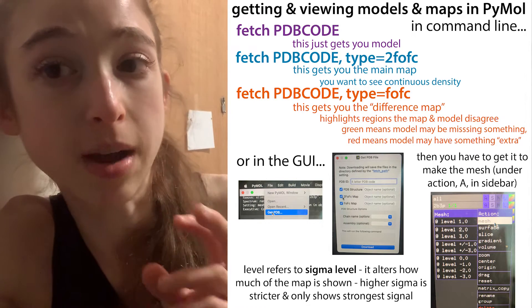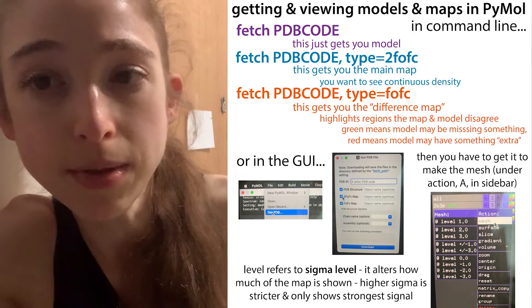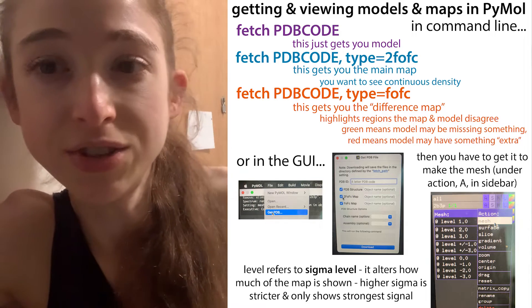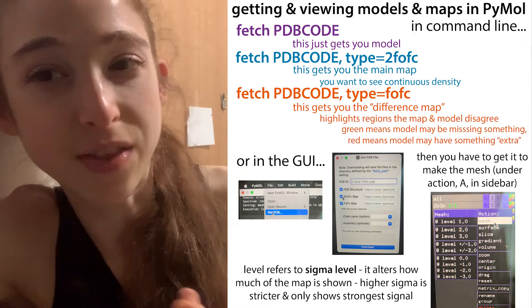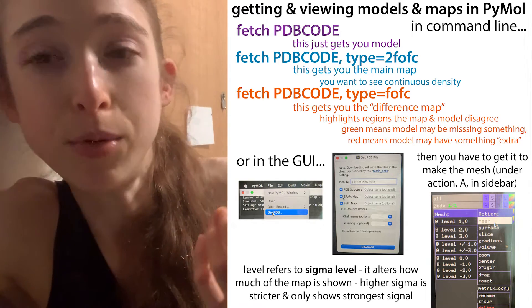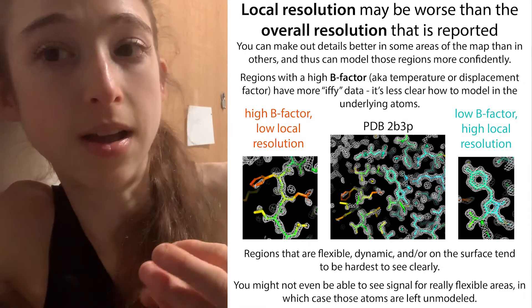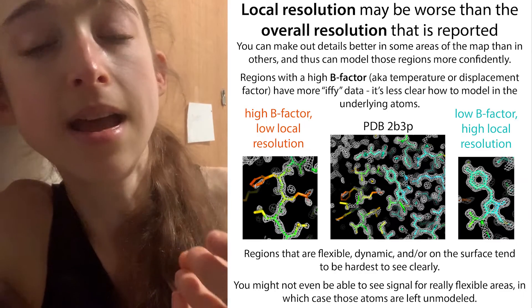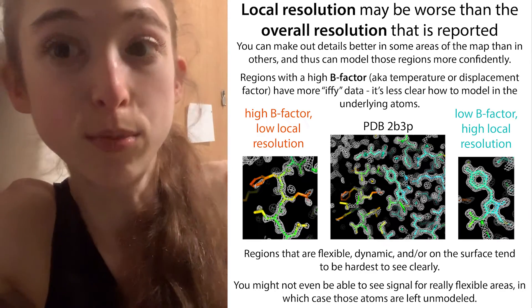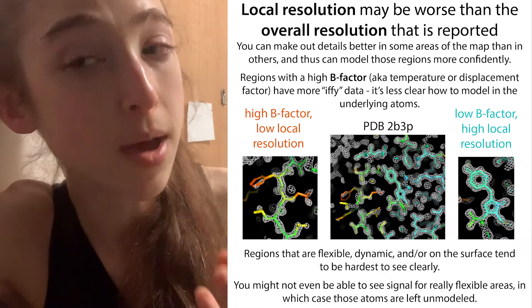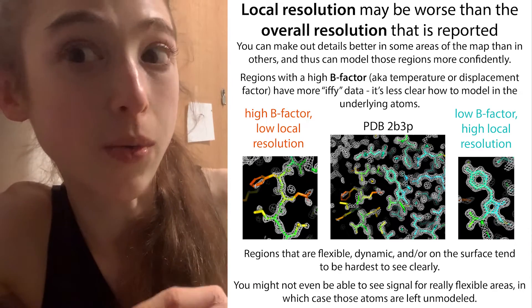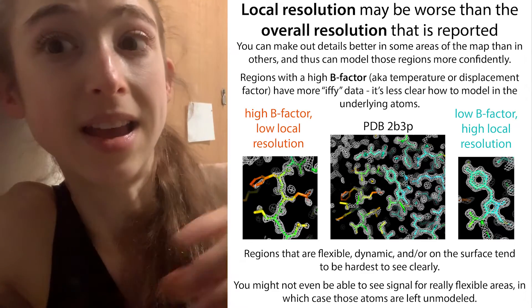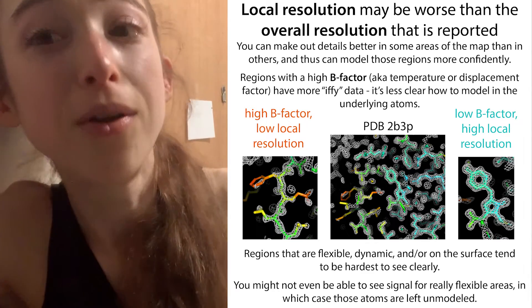You have to go through a couple of extra steps to actually view the maps, so I wanted to give a quick demo of how and why you should do that. I have more on this in other posts about why it's important not to just look at the global statistics, which you can find on the PDB — the Protein Data Bank — where you can find global statistics about how well the model fits overall. But you really want to go in and visualize the model and the map together, and so we're going to do it in PyMOL right now.